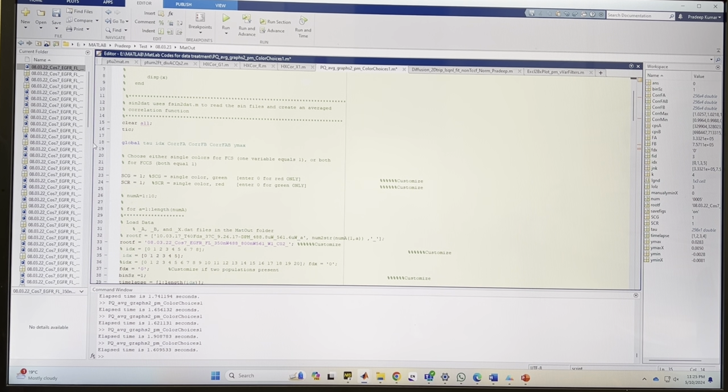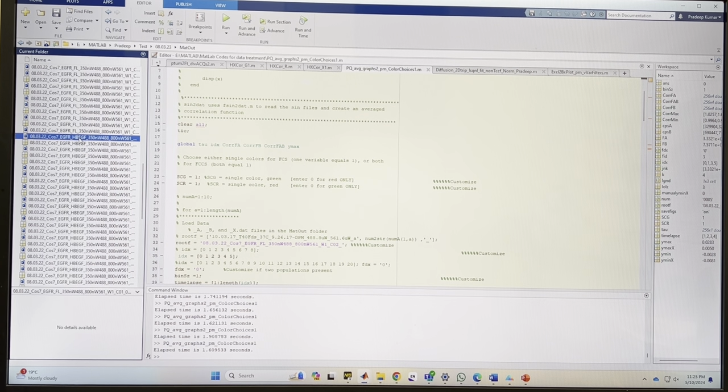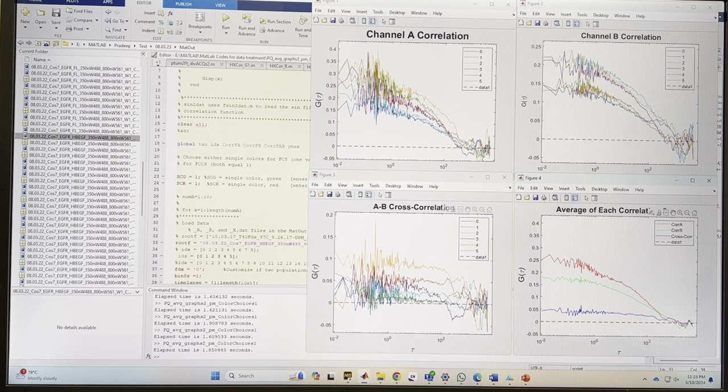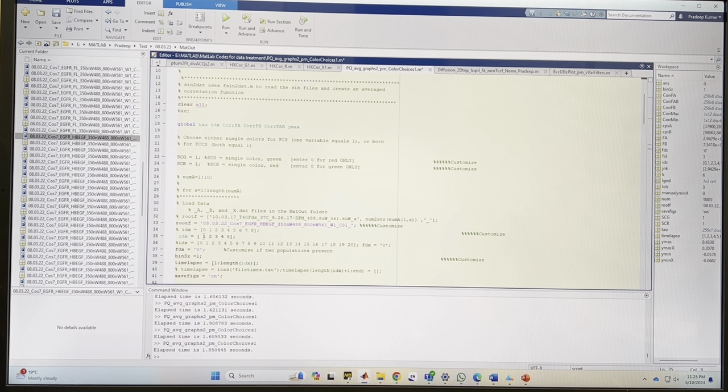And here, because I took only 2 readings for 1 sample, I'll go with another name. So we have another one, after ligand addition. So select this one, rename, and then copy, and I can paste this name here, and go back to C1 only, cell number 1, and then F5. So you see here, mostly it looks okay, but the one I can see here, which is 0, is looking out of shape. So I'll remove this one, and then F5 again.